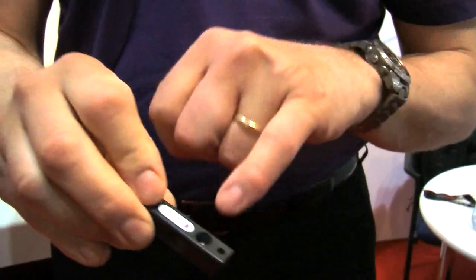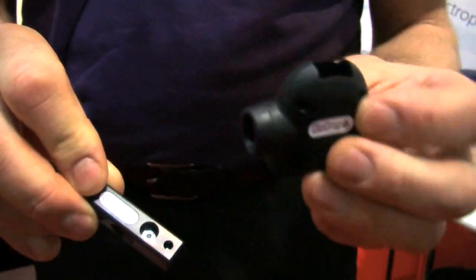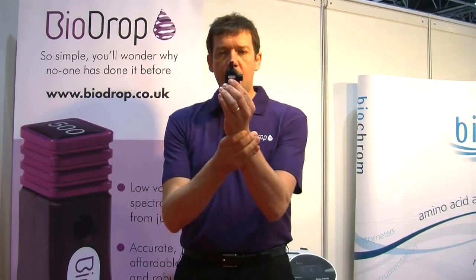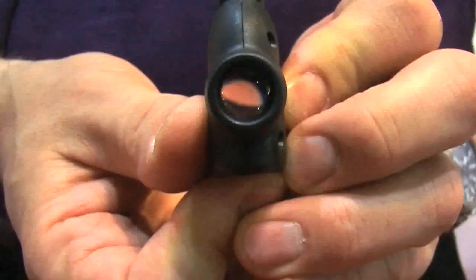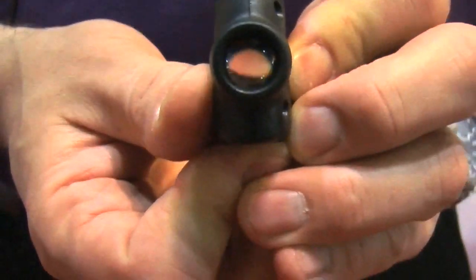So what we've done on this product for the first time ever is you can actually see the sample. You can see through it — it's very very clear. To make it even better, we've included this small magnifying bubble viewer. You can just hold it up to the light and see directly through the sample, and you can see if any hair, dust, or bubble particles are actually in the sample area. So not only is it a very accurate and easy to use device, it's actually the first device in the marketplace that allows you to easily see the sample before you put it into the spectrophotometer.